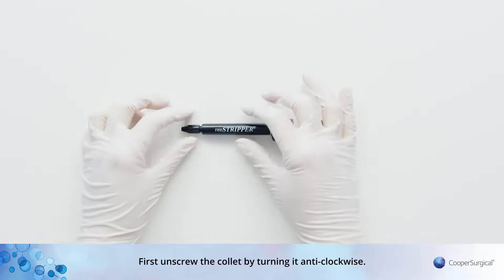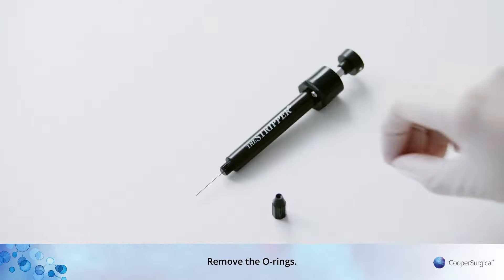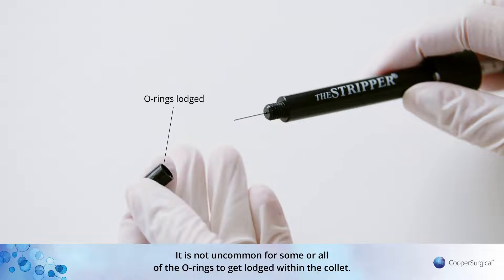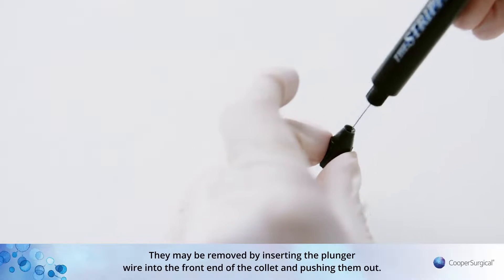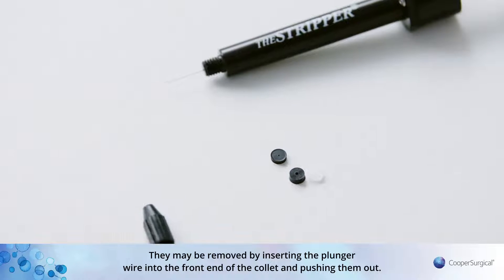First, unscrew the collet by turning it anti-clockwise. Remove the O-rings. It is not uncommon for some or all of the O-rings to get lodged with the collet. They may be removed by inserting the plunger wire into the front end of the collet and pushing them out.